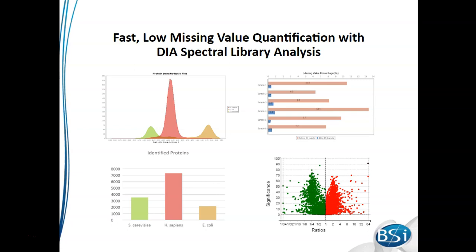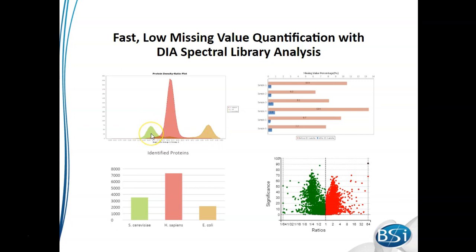For example, here in this study where three different proteomes were spiked into a Timstof experiment, we're able to fully separate the human, E. coli, and yeast proteomes, even though they are expected to come out at completely different ratios and still get excellent proteome recovery.